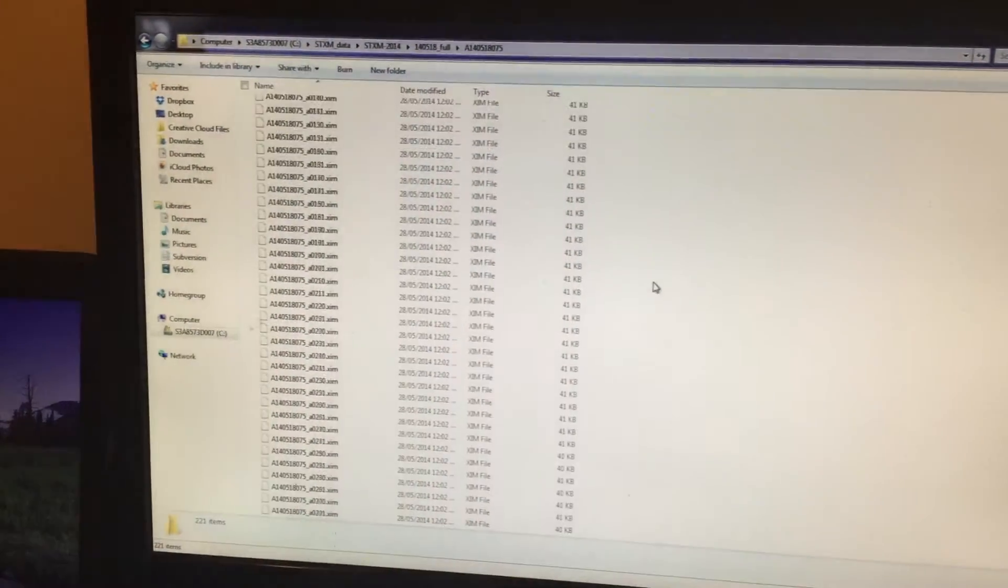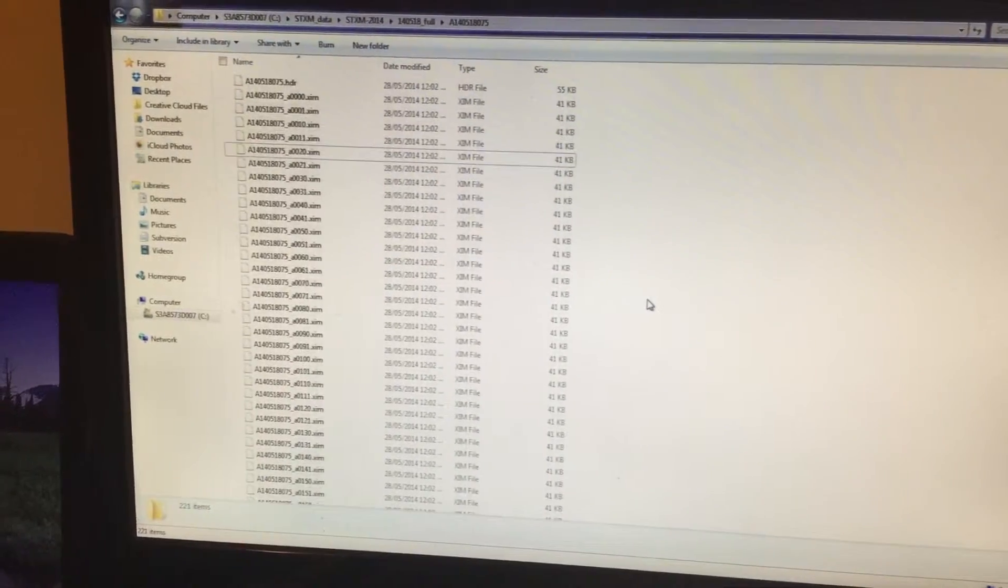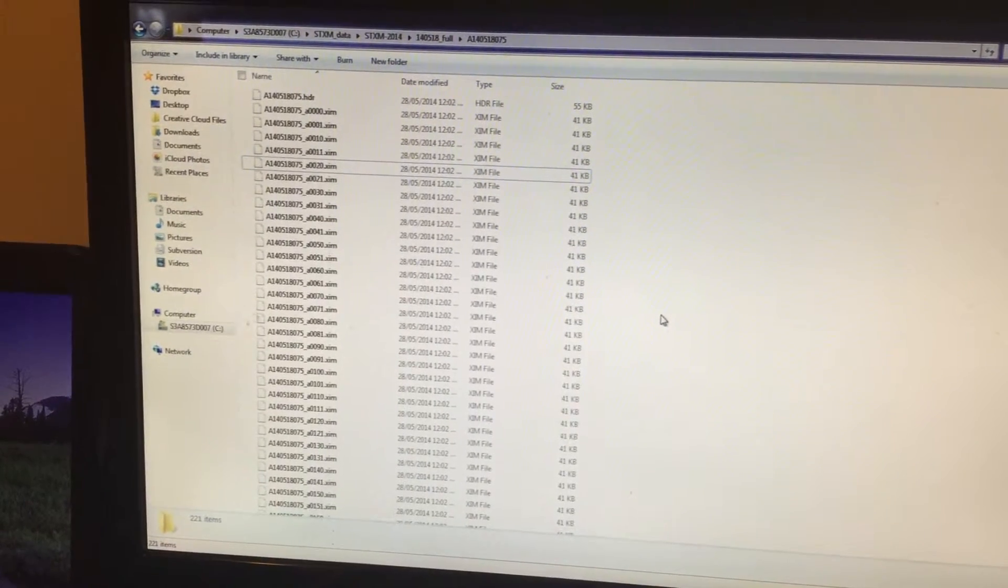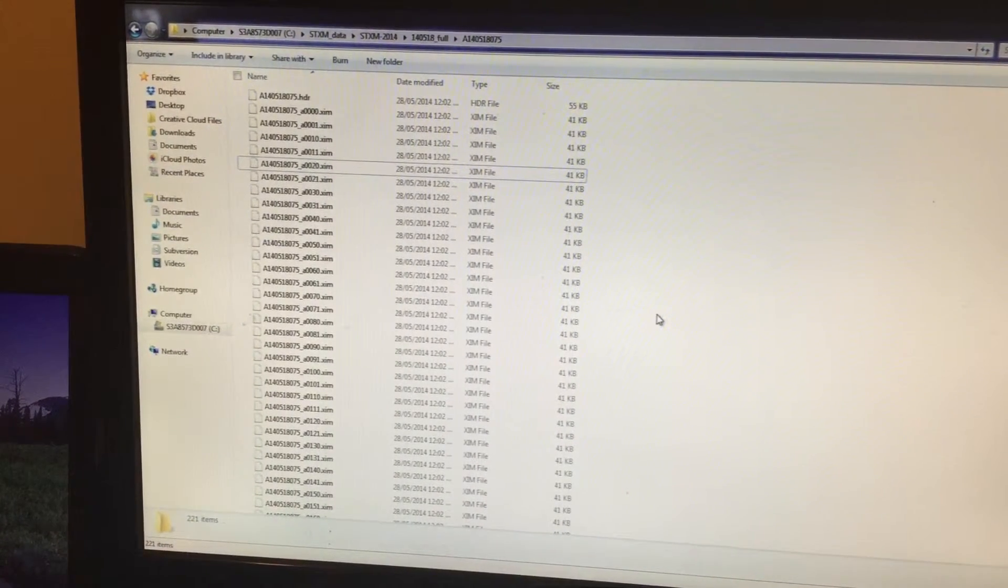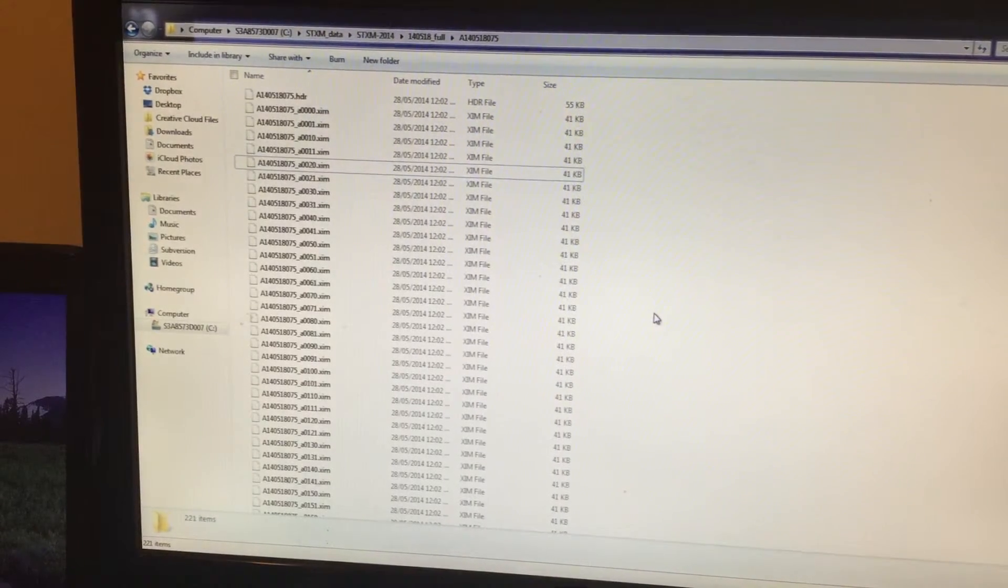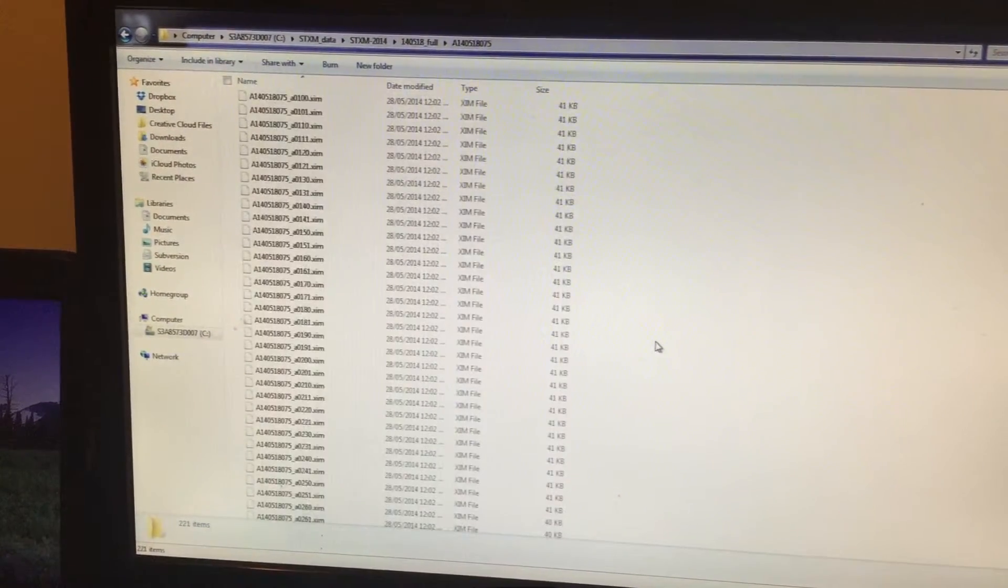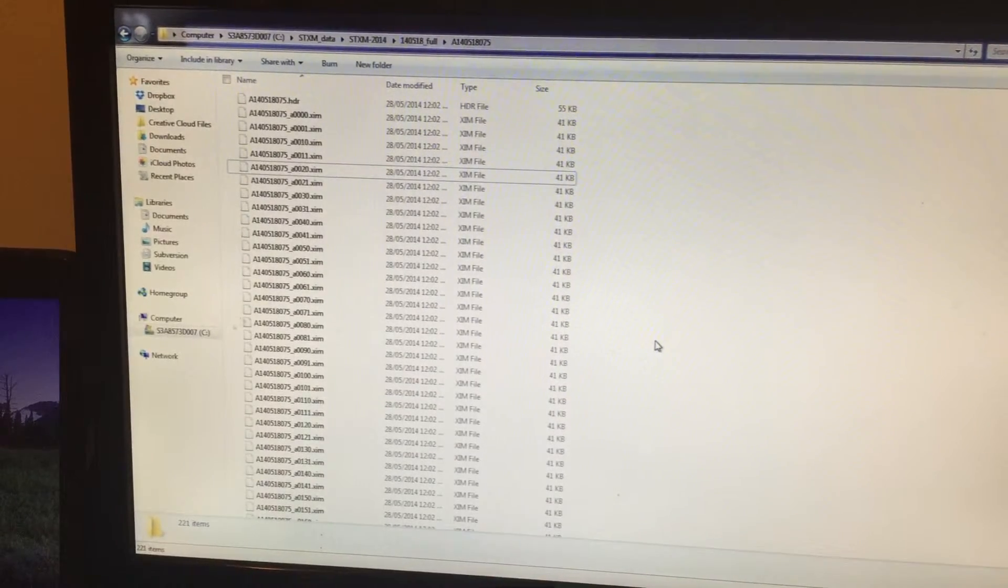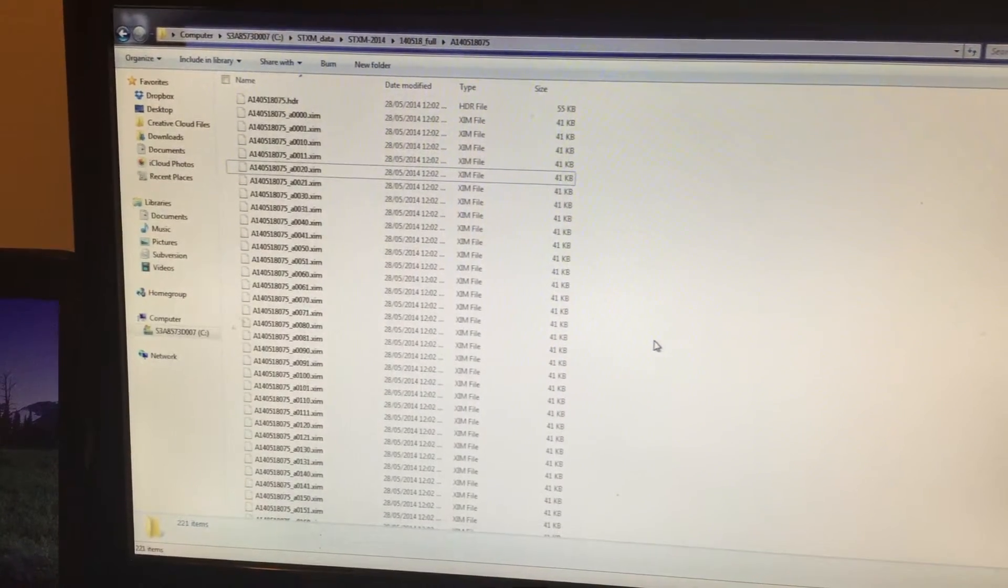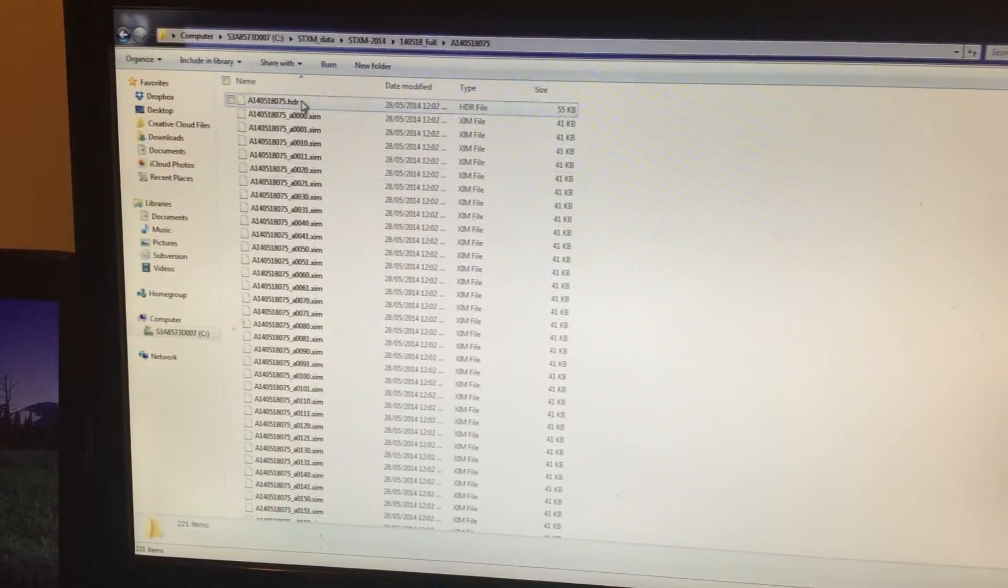Here you can see the data collected from the STICSUM. We did some XMCD measurement on a single nanowire, and it has data corresponding to both left and right circularly polarized light. We collected an image at each energy point, then we generated a stack.